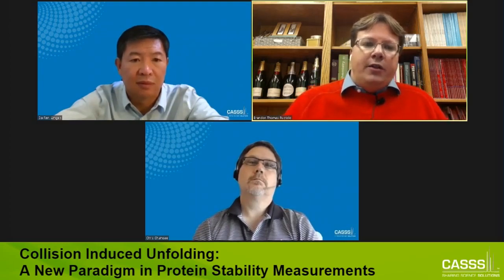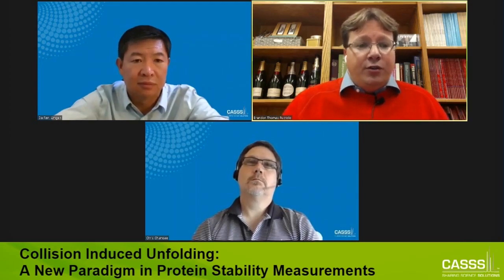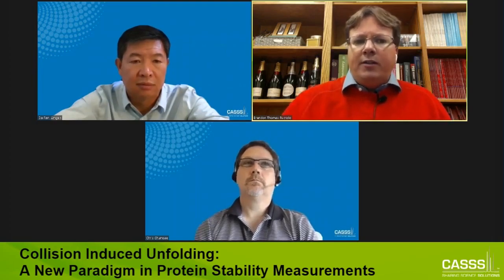So yeah, I think the models here are very early stages, very cartoon, as you pointed out. Like I've already mentioned, the first transition we think is related to Fab. Fc is probably later on, and it takes more energy to unravel. But the mode that that's accessing and the amount of internal temperature that takes and the extent to which that's actually modifying the structure and what form that takes, I think all of that's still unknown. And we're working on that problem with a lot of different techniques and technologies, including molecular modeling, to try and figure that out. Yep. Thank you.